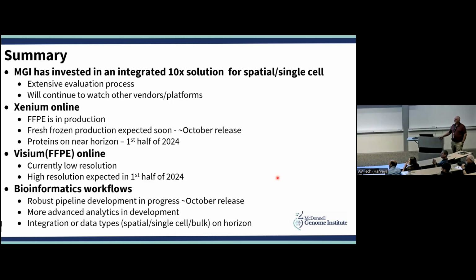Sorry, it's hard to hear from the back of the room. Would it be the same thickness? I think they're the same thickness. And if I recall, don't quote me on this, but I think they were saying that Visium HD will be roughly the same price as Visium. Sequencing will be more, but that's the variable part.